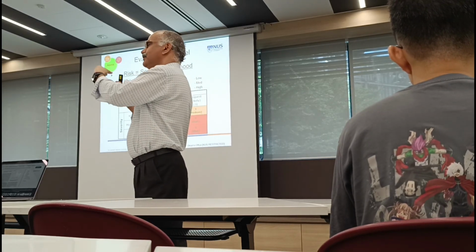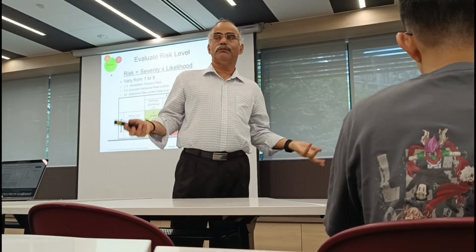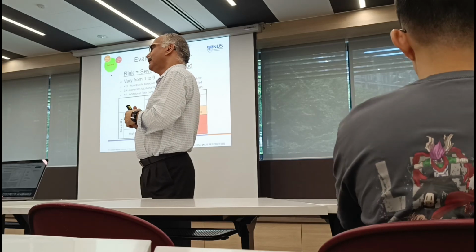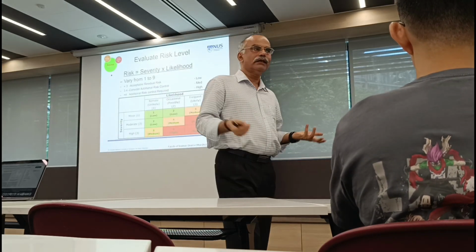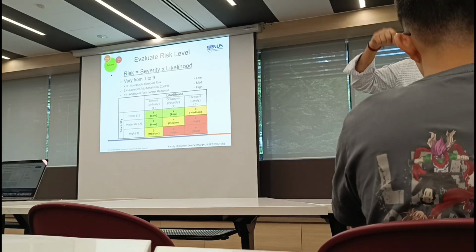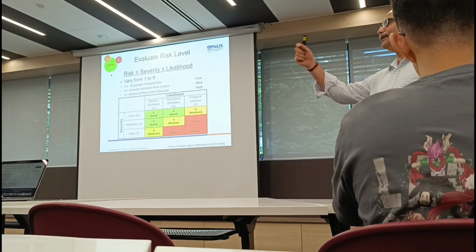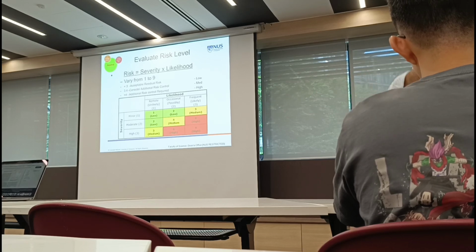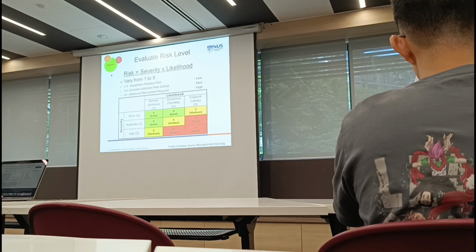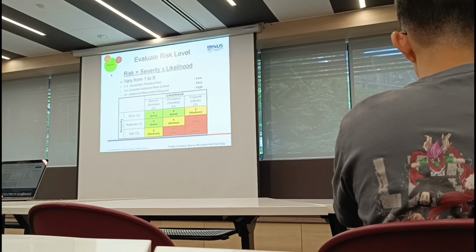So there are many steps you can take. Or I replace the lithium aluminum hydride with sodium borohydride, which is much milder. Then I can do that. Or use another reducing agent or something else, right? Again, these are decisions you can make because you are the one who knows the reaction well, right? And you can do a literature search and see if there is an alternative process I can use, which is much safer than what I'm thinking of, right?